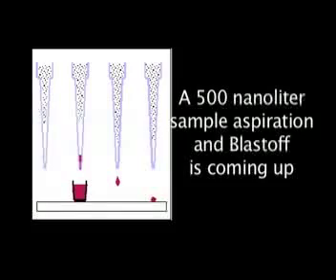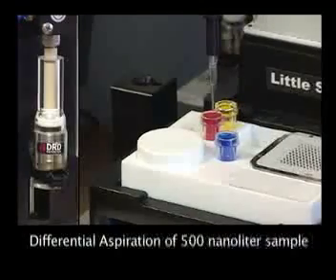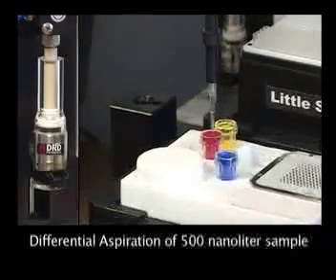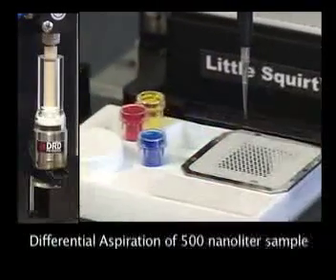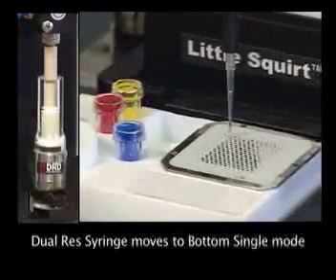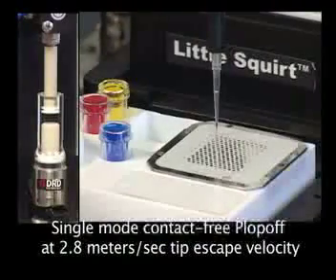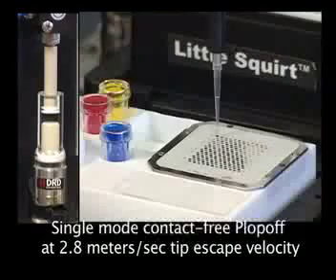A 500 nL aspiration and plop-off are coming up. Watch the dual-res syringe glass assembly move down .3 mm there for precise differential aspiration of 500 nL. Then the DRS moves down to single mode to blow the tiny sample cleanly off, contact-free, at 2.8 meters per second right onto its tiny target.